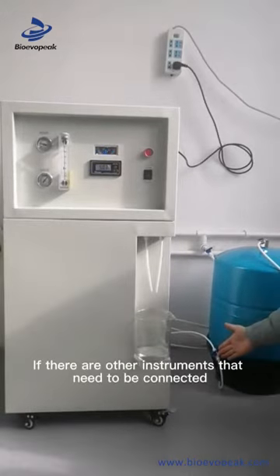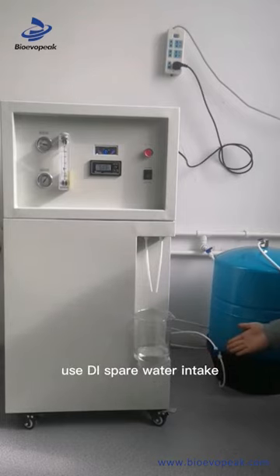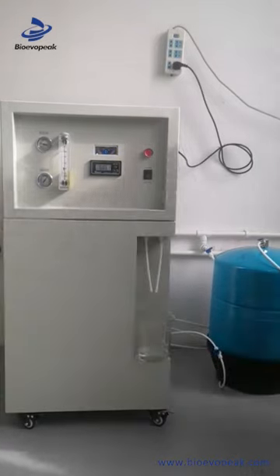If there are other instruments that need to be connected, use the deionized water intake.